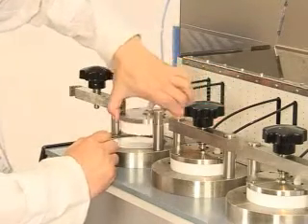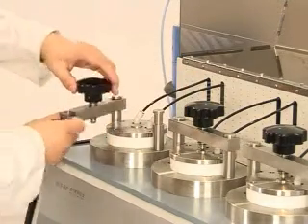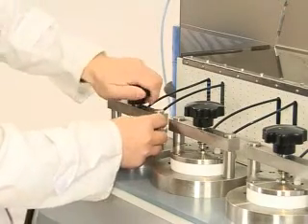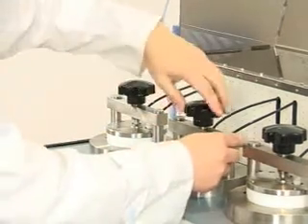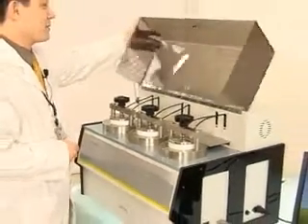After this, close the chamber and tighten the knob. The other two chambers are the same. After this, close the cover.